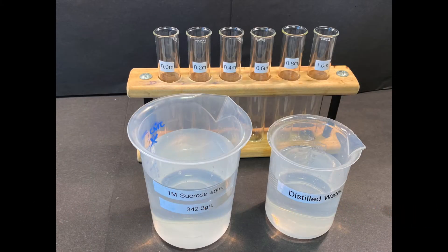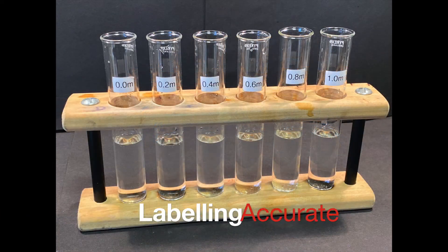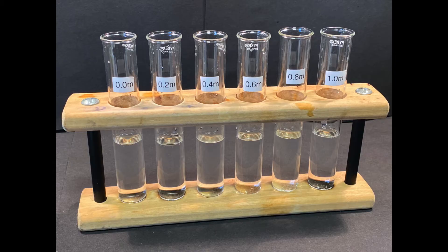Using the one molar sucrose solution and distilled water, by means of the 10 milliliter syringe, make up the dilutions indicated on the boiling tubes. Using the marker pen provided in your kit, accurately label the boiling tubes with the dilutions that they contain. Please ensure that you have made up an appropriate volume of each concentration to cover your potato sample.